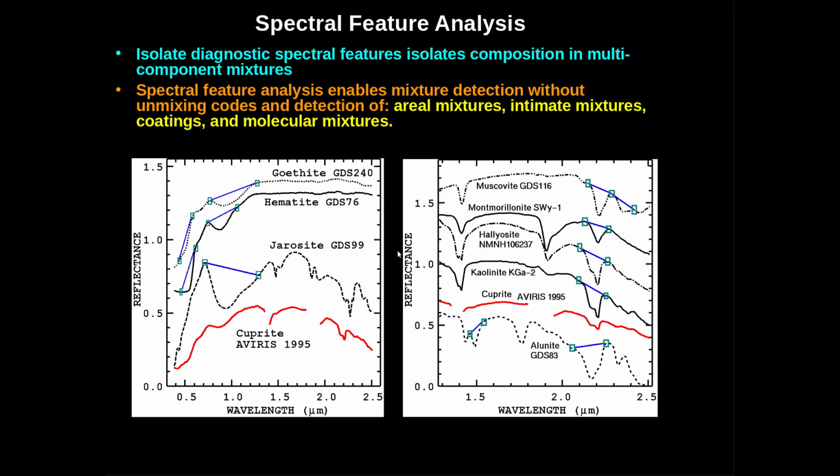So you can think of your favorite spectral region and features that you see in your favorite spectral region. We just need to know what you as an expert spectroscopist knows are the most key features in the spectrum that you use to identify a compound. And we can put that into Tetracorder and do that same thing. And I've seen people describe how they identify particular things in a spectrum, and it's kind of similar throughout the whole spectrum, whether it's UV to mid-IR, far IR.